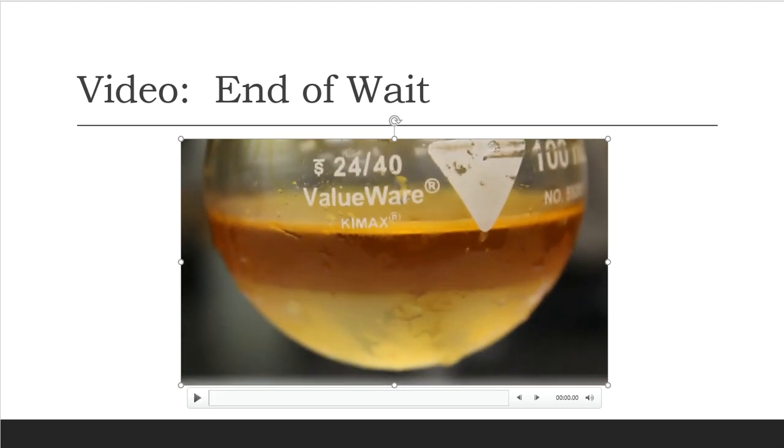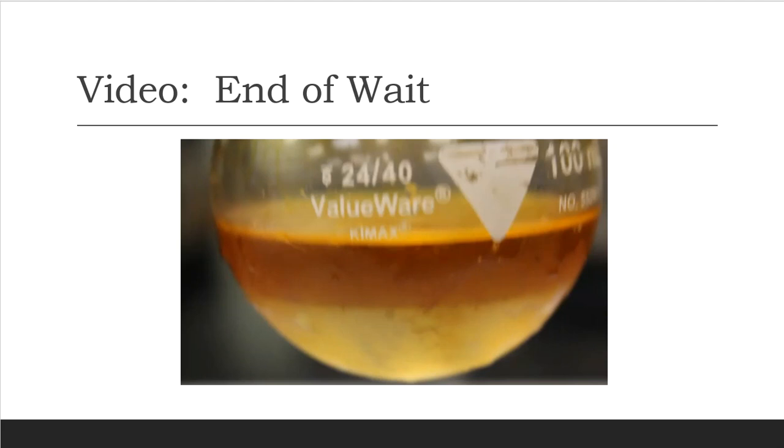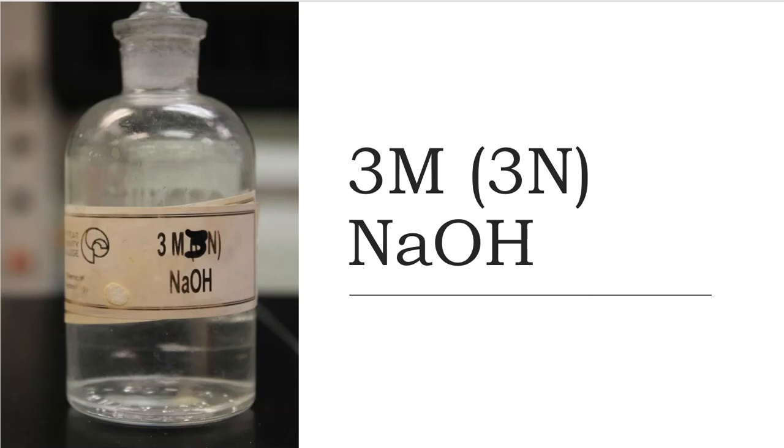Okay, so in the next part of the procedure, like the anti-Markovnikov would require, it's going to make me focus on sodium hydroxide. The reason it tells me to focus on sodium hydroxide is because this, ding ding, is my OH source. My OH source is needed for this reaction to go forward, especially if I'm going to add on an OH group. Where does the OH group come from? Well, I have water. I've already added that. I've got my OH from sodium hydroxide. I'm getting ready to add it. And then it also requires hydrogen peroxide, and I'm getting ready to add it as well.